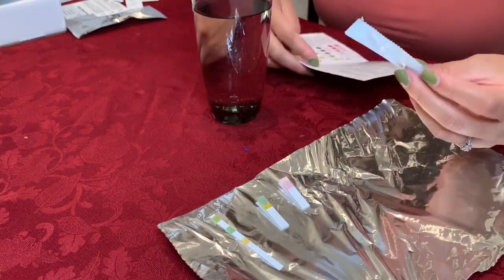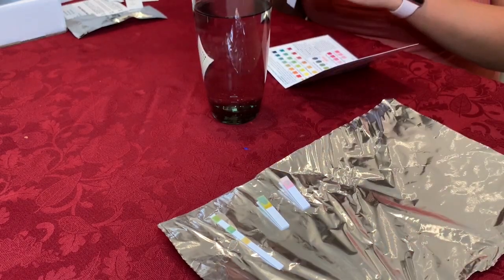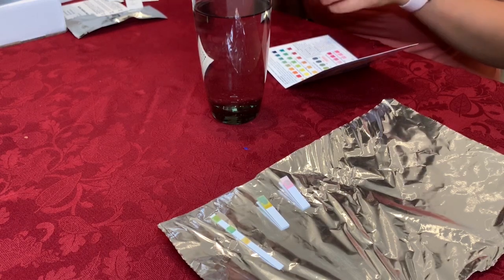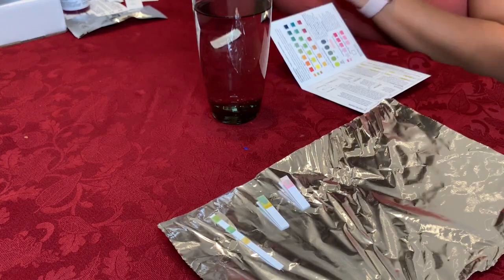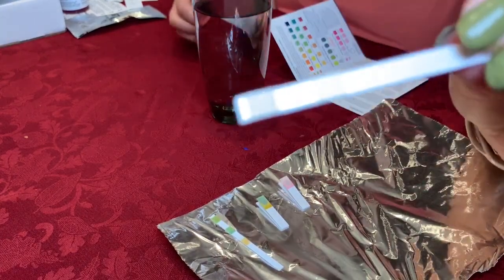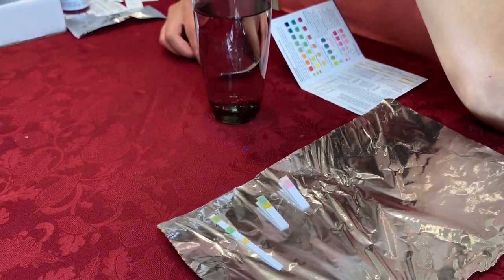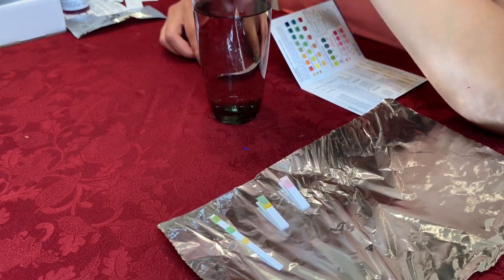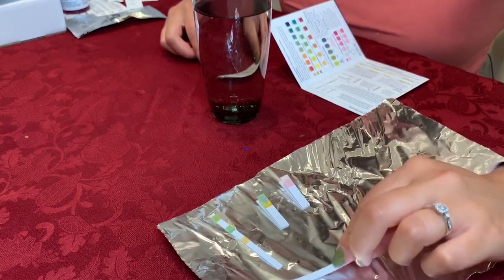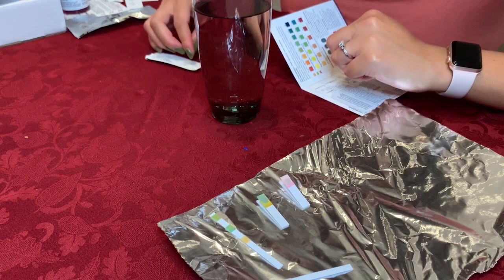The next test is the nitrite and nitrate test. Why is this so difficult? They don't want me to know what my nitrates are — now I'm even more curious. Finally got it out. Doesn't look like anything special right now. This is the nitrite nitrate test, and we are supposed to dip it for two seconds — one, two. And now that it's been dipped, I have to wait for one to two minutes and then match to the colors.